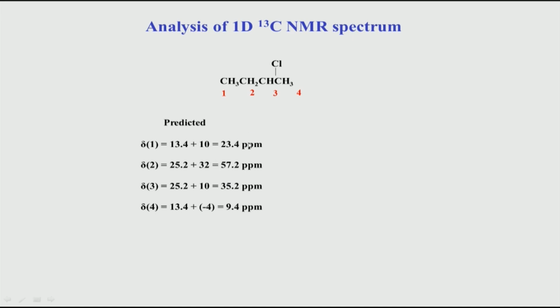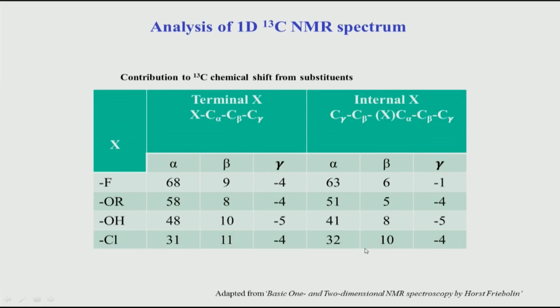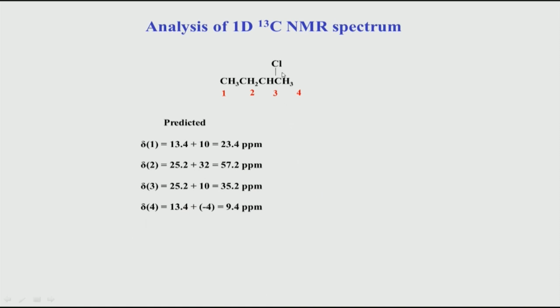Actually there is a slight error here. What we are looking at is this side here. Here the numbers are reversed. It should be 1, this is for 1, this is for 2, this is for 3 and this is for 4 here. So, there is a typo here, you have to just reverse this order.